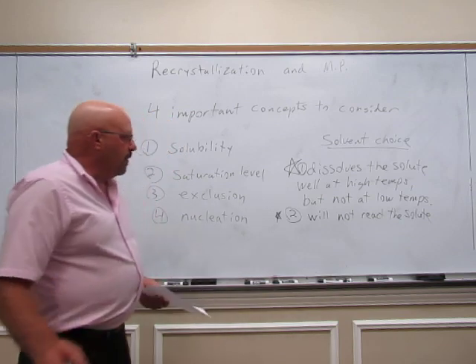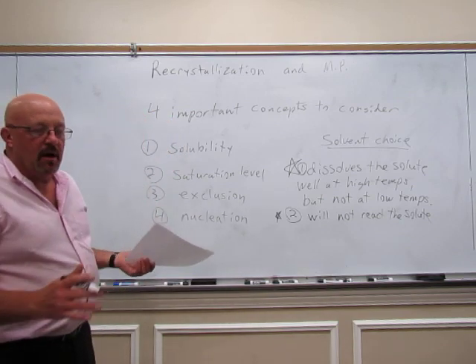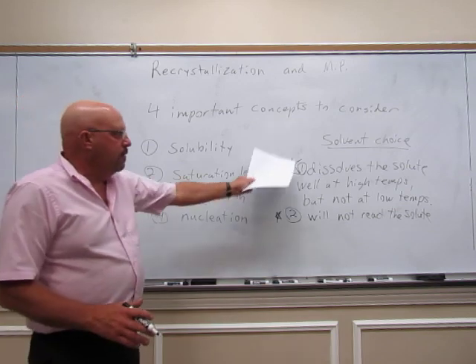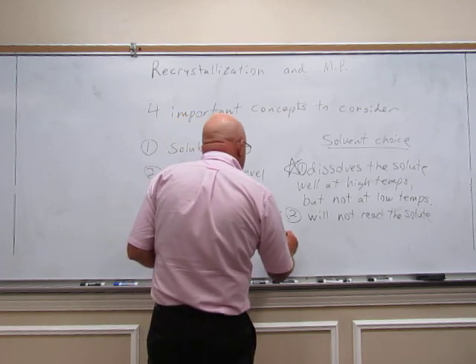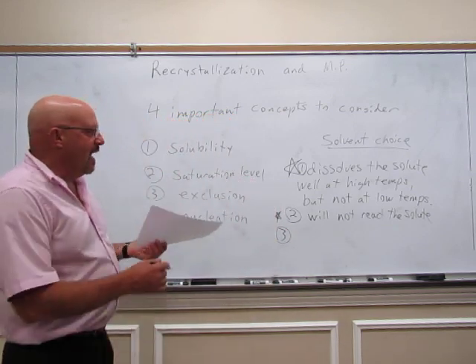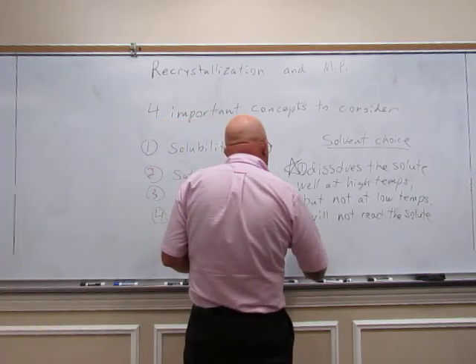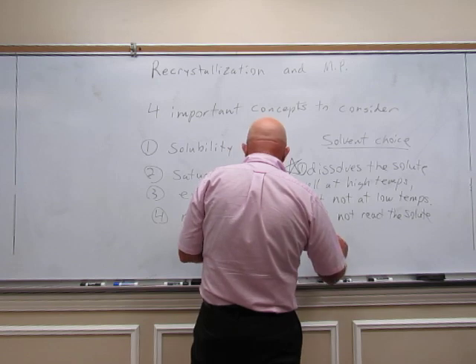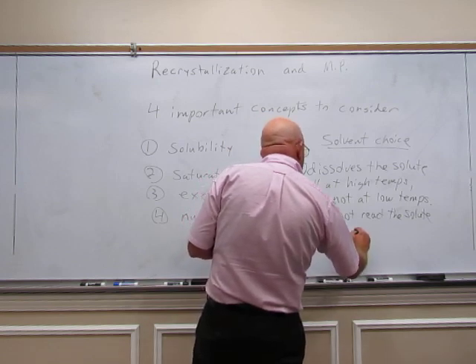Now the last ones that I'm going to put up are nice to have, but not an absolute requirement. You must have the first two. That's why I've got stars beside those. The third one here is just a bonus. It's nice to have this, but it's not an actual requirement. It's best if the solvent is non-flammable.